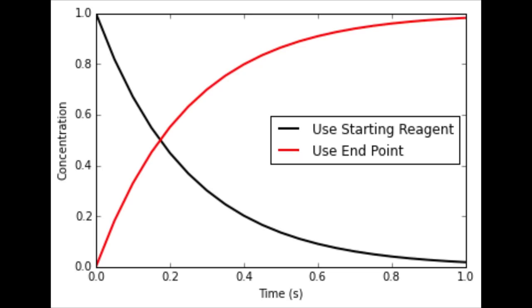Again, it is necessary to choose a path length. For fluorescence, it is generally recommended that the two millimeter path length is used as this minimizes absorption effects that can distort the signal.